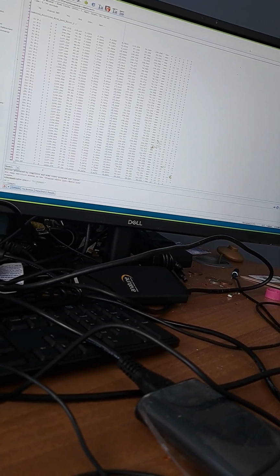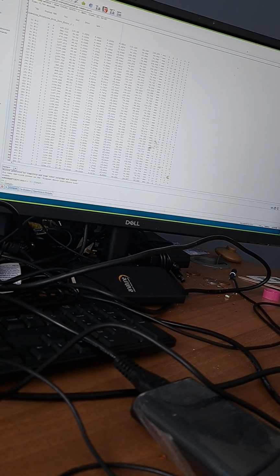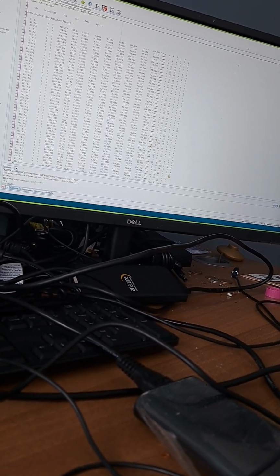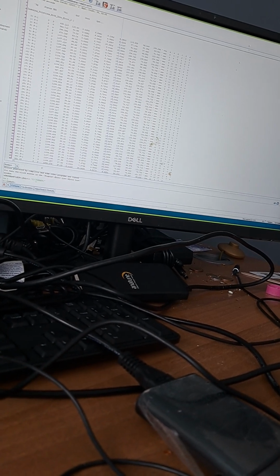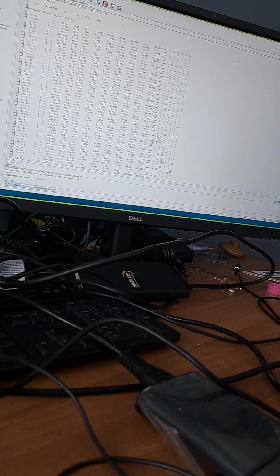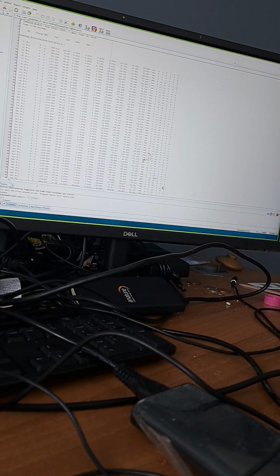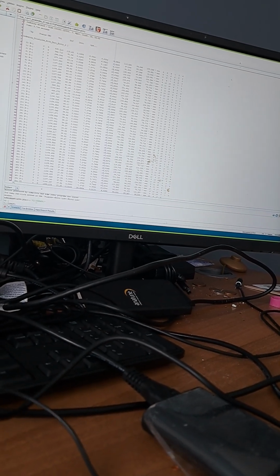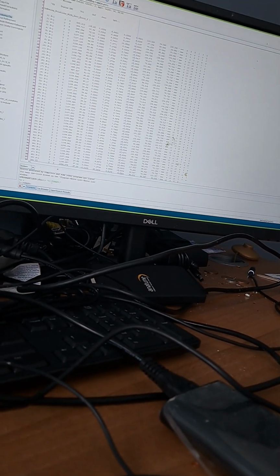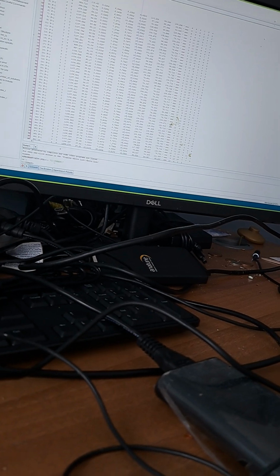So there's ones at 430 and 115. That looks okay. The unit cell seems to be a lot smaller, so you're going to have to divide that by 2. So that's 215 cubic angstroms. Per molecule or per unit. So is 215 ringing any bells? Is that myconazole by itself, or what is that? Shall I just quickly check the molecular mass of myconazole? It's not the mass, it's the number of non-hydrogen atoms. That's what you need.